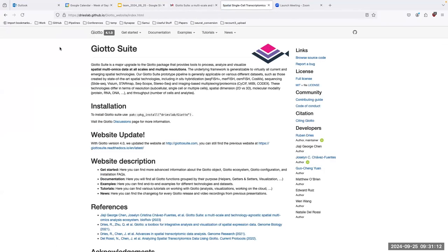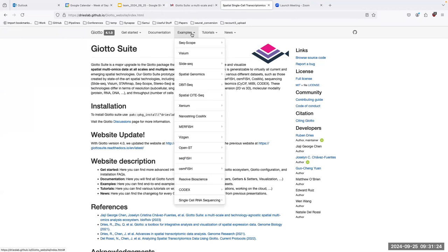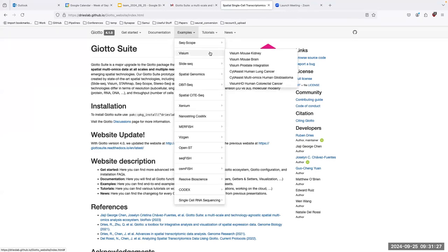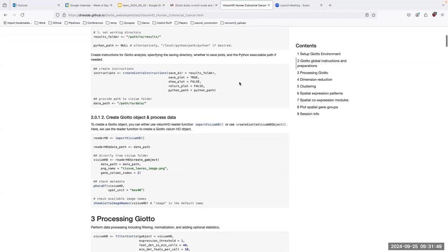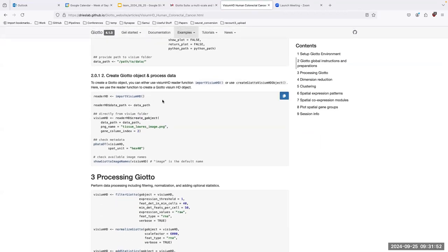The documentation is pretty thorough — it's a website similar to what we make for our own packages. Some specific things that are interesting: they have examples for Visium, and they already have Visium HD examples. It's cool to see that they have support for HD data already, with functions to create the object from Visium HD, which will be interesting for what I'm doing.